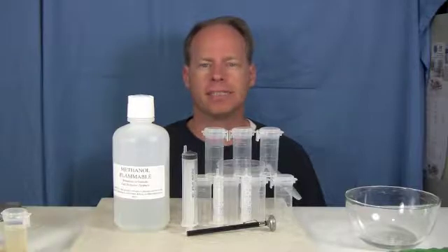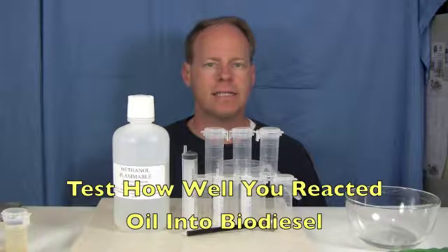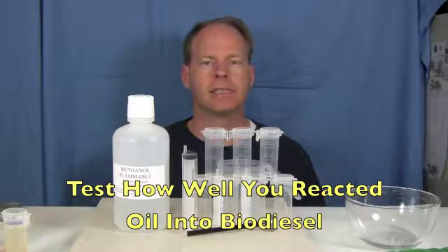Hi, my name is Graydon Blair from Utah Biodiesel Supply and today we're going to cover the biodiesel conversion test. This is a test that you can do to see if your oil has been reacted fully into biodiesel.